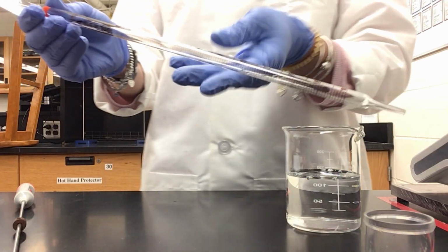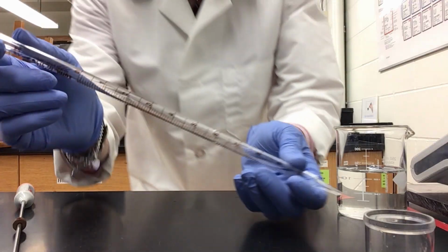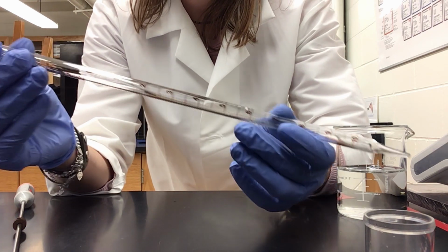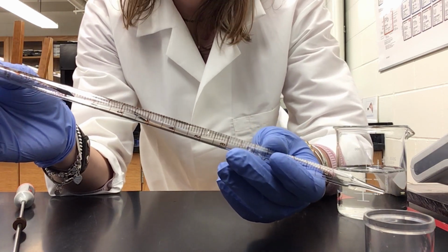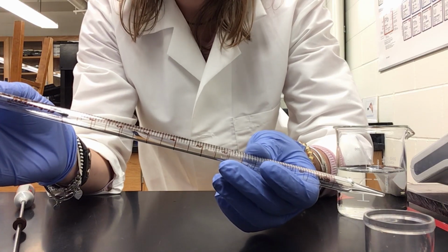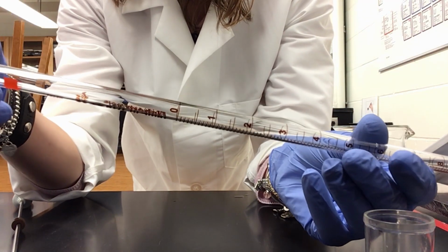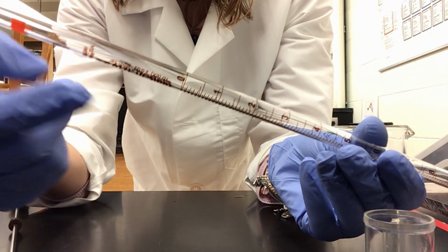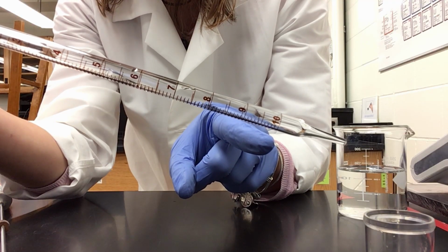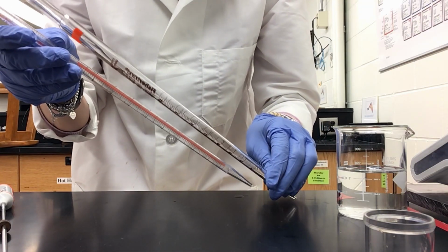So now I want to show you some specifics of this pipette. First of all, not every pipette is exactly the same. So for example, this is a glass pipette, Fisher brand, that is supposed to be very precise. And as you can see, it has the 0 marking right here, and then the 10 milliliters marking right here. Then we have this other brand. You can see that they're different, right?